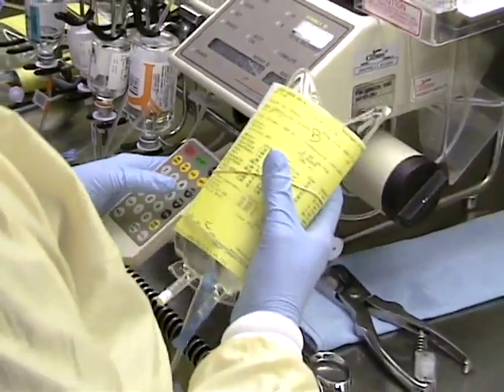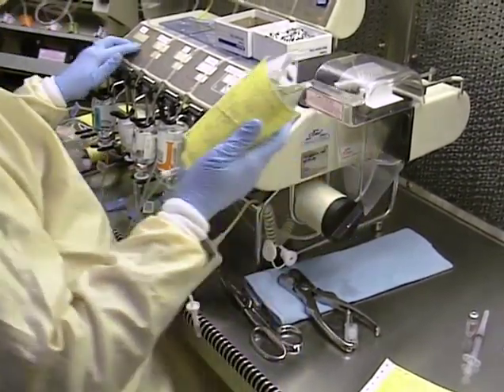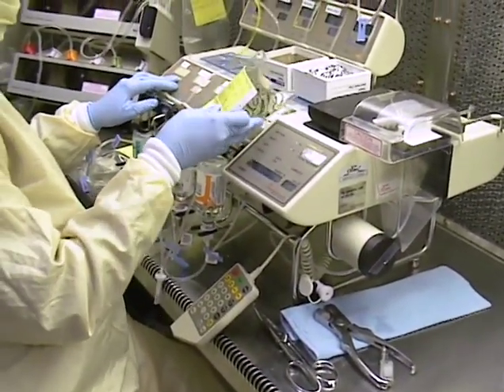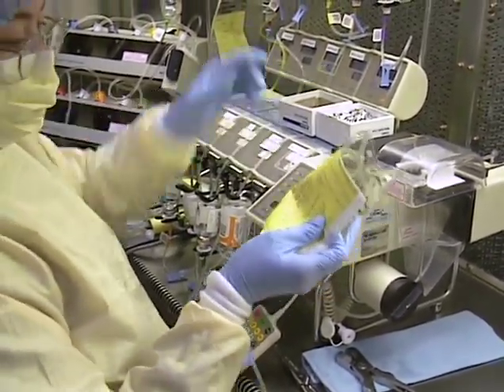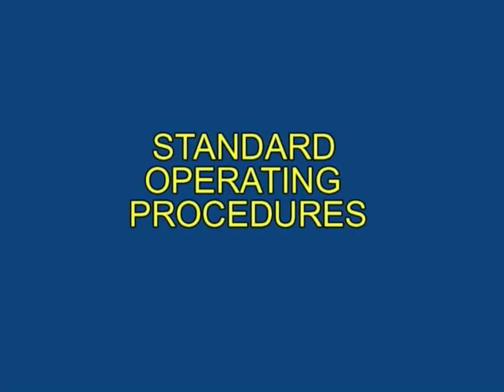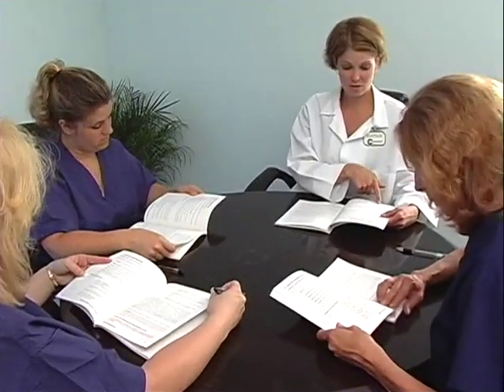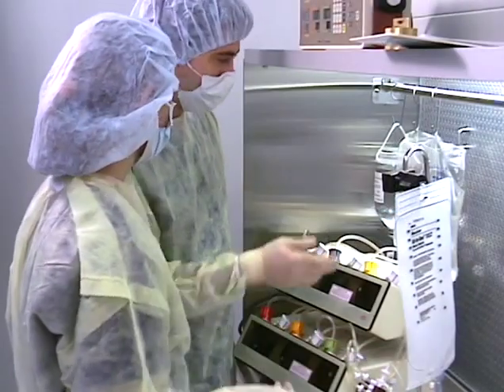While both supervisory and compounding personnel are responsible for becoming familiar with and implementing USP 797, operatives and line personnel should not be permitted to make policies, procedural decisions, or interpretations directly from this standard. Rather, pharmacy administration should initially develop and interpret all specific procedures, facilities, equipment, and documentation necessary for compliance in the form of complete, executable standard operating procedures, or SOPs. While not an exhaustive discussion of USP 797, this program will focus on the newly upgraded aspects of the standard directly affecting operatives and line personnel.